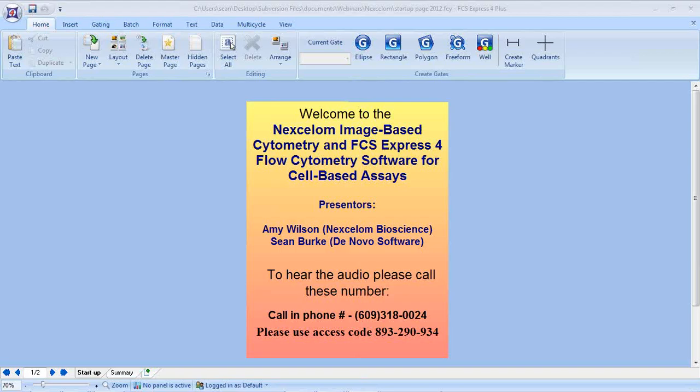Alright everybody, welcome to the Nexcelom Image-Based Cytometry and FCS Express 4 Flow Cytometry software for cell-based assays webinar. It's a long title, but today Amy Wilson from Nexcelom Bioscience is going to be presenting on the Nexcelom instruments, I believe particularly the CBA Vision, which allows you to export any of your Nexcelom cell-by-cell data to FCS Express 4 Flow Cytometry directly.